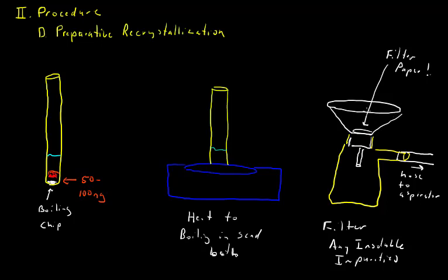So that's in your microscale kit. It's a small conical funnel that will fit right into your small filter flask. You'll hook the filter flask up, make sure you clamp this so it doesn't tip over. Hook the filter flask up to the water aspirator. Very important to put in a piece of filter paper. So you're going to cut out a piece of filter paper that fits the little fritted disc in the Hirsch funnel. I've got a guide in the laboratory that you can use to do that. Makes it easy to cut these things out at the right size.